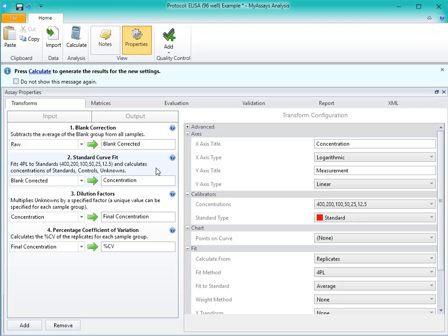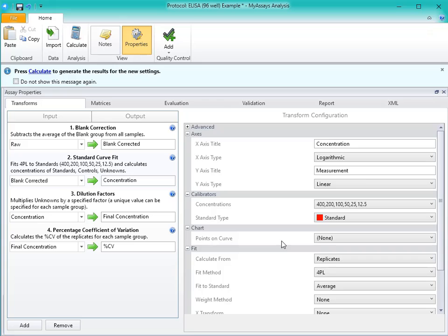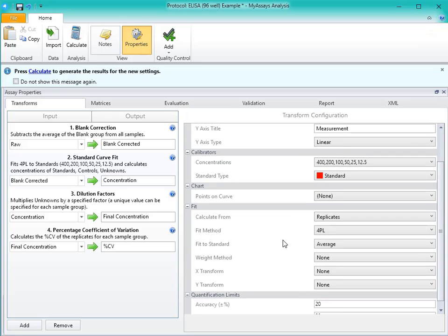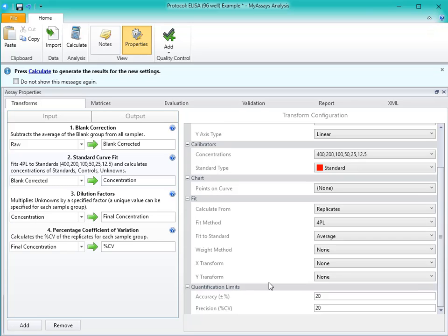You can define various settings in the Standard Curve Fit Transform, like the axes, titles, and types, the standard sample type and concentrations, what points to include on the curve, whether to calculate from replicates or average, the fit method, weighting models, X and Y transforms, and your accuracy and precision quantification limits.